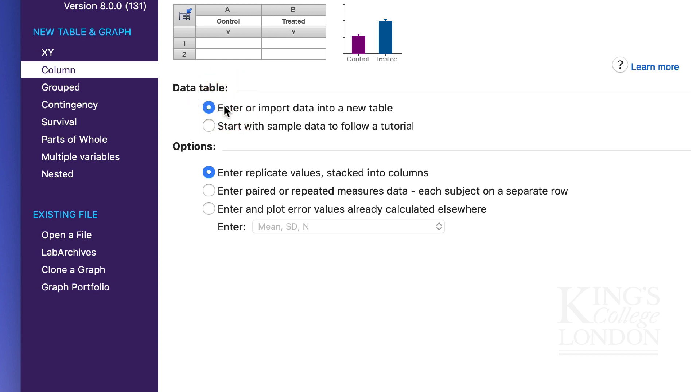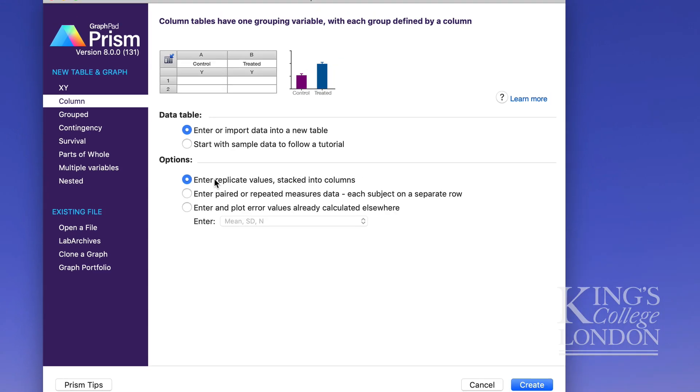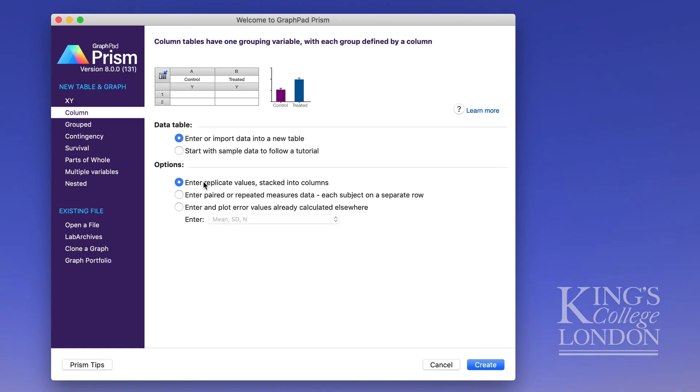Under options you want to select enter replicate values stacked into columns. For a student t-test you are comparing two groups of data from two different treatments or two different groups of a population in which case you want to put replicate values one on top of each other. This is a unique feature of GraphPad Prism because in Excel and many other analysis tools you don't have to place your data into columns but you can place them into rows. So we choose stacked into columns and click on create.